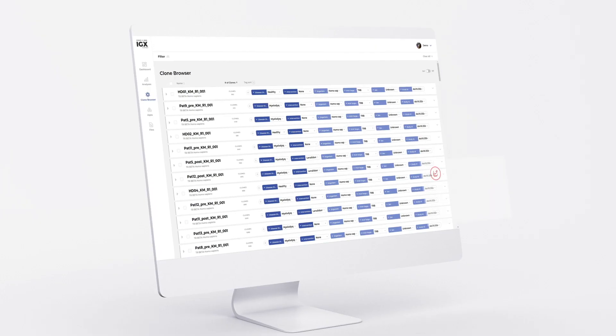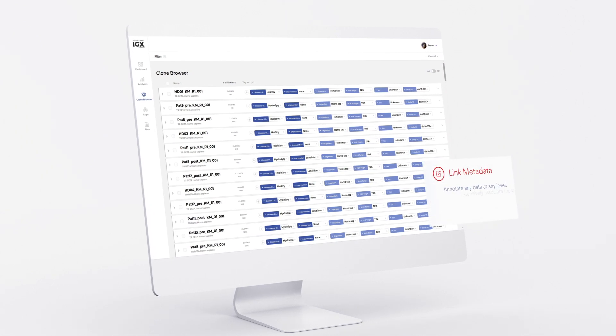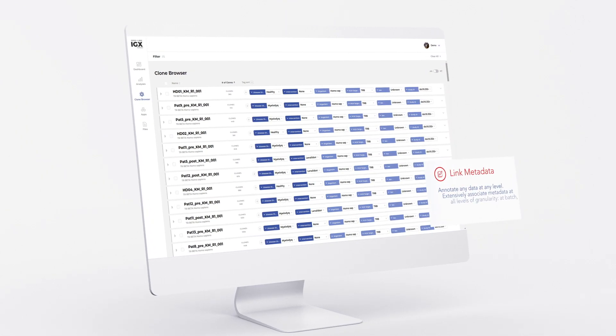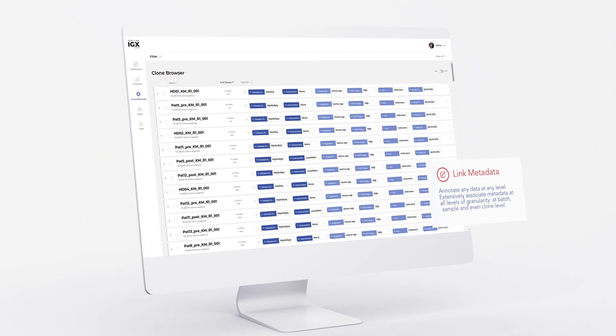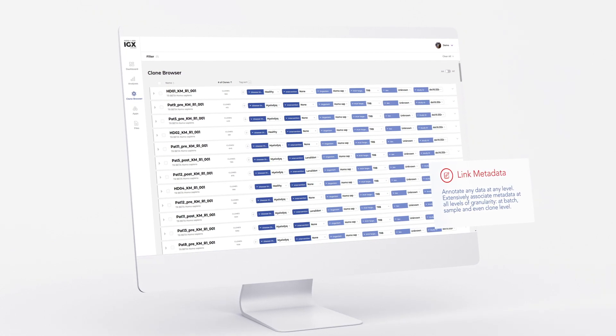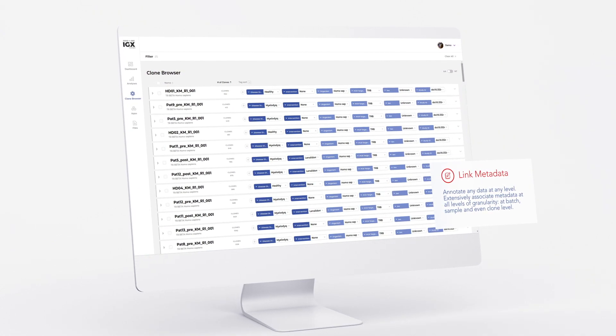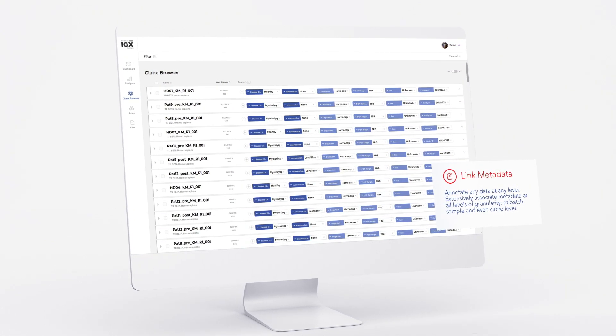Proper annotation is key, linking repertoire sequencing data to metadata which describe clinical or experimental parameters. The IGX platform was designed specifically for this purpose.